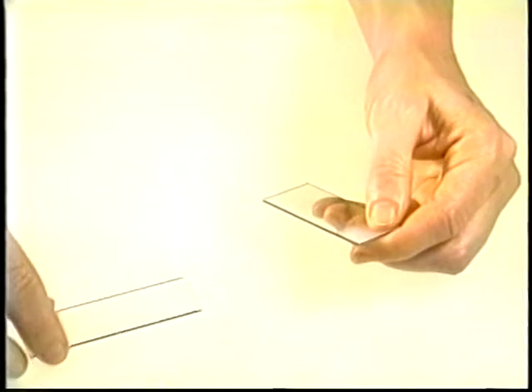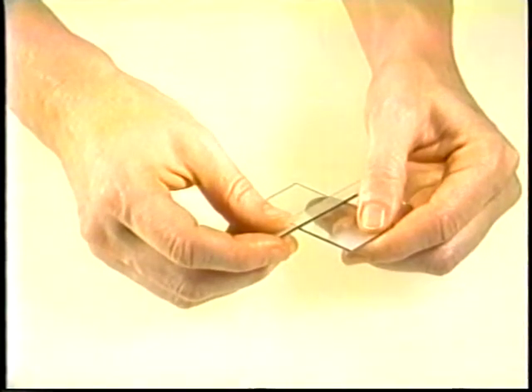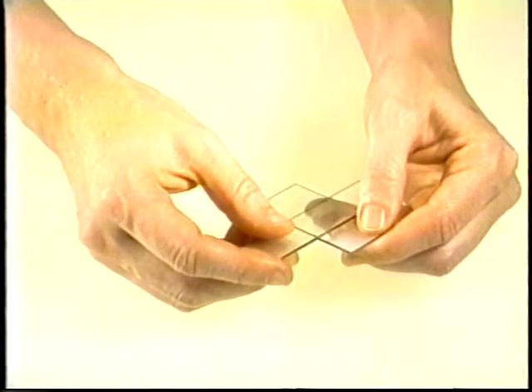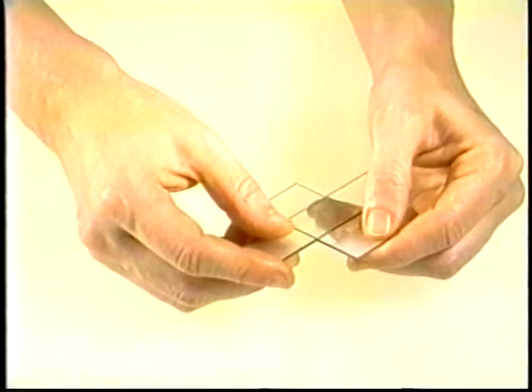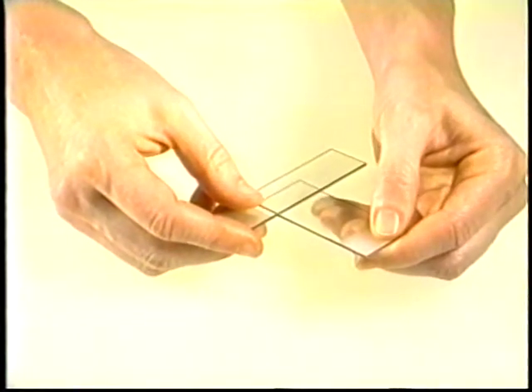Then a second slide is picked up and put in position like this, resting across the bottom slide. The top slide is rotated down until it is parallel with the bottom slide and starting to spread the harvest. At this point, the top slide is allowed to slide along the bottom slide, further spreading the harvest.